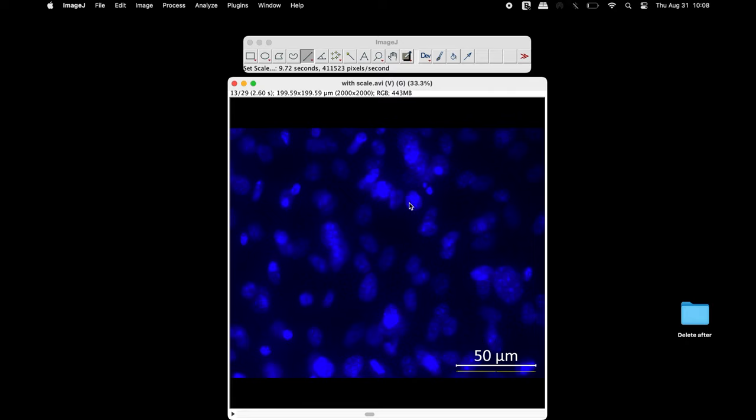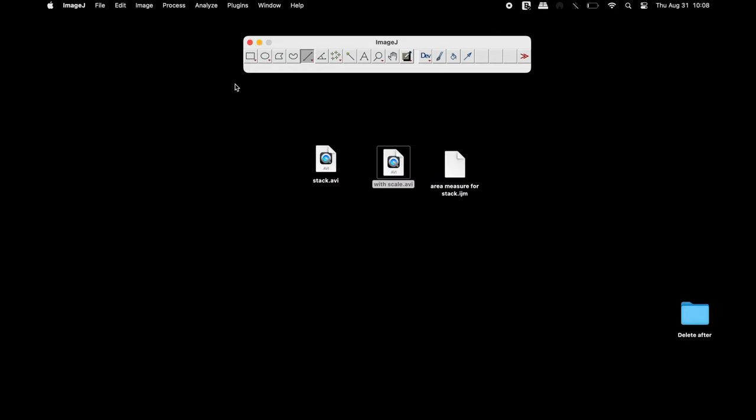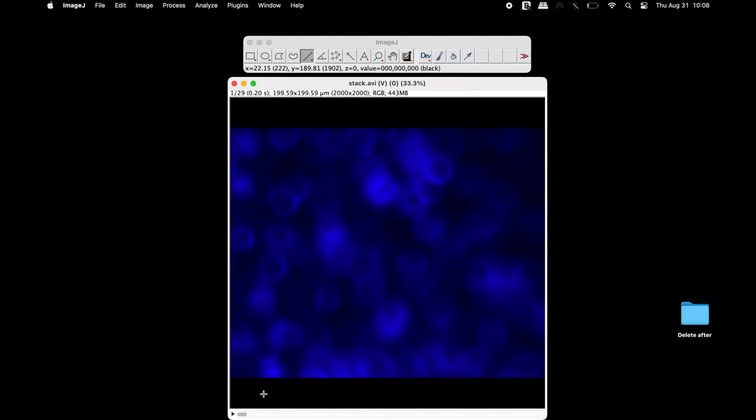To measure the area and mean intensity, an alternative image can be used that excludes the scale bar.